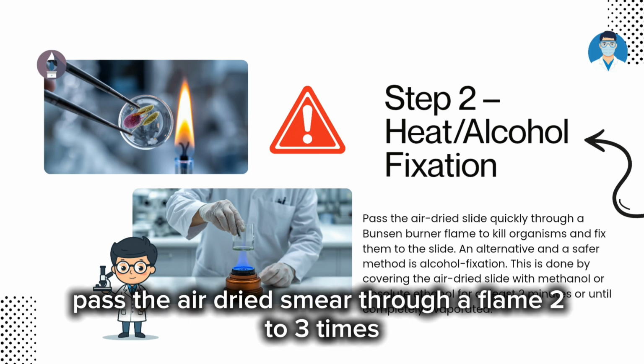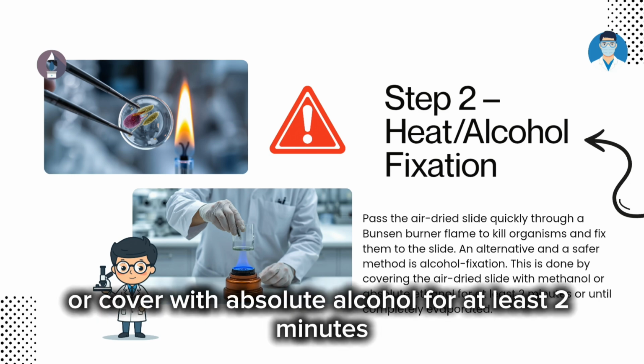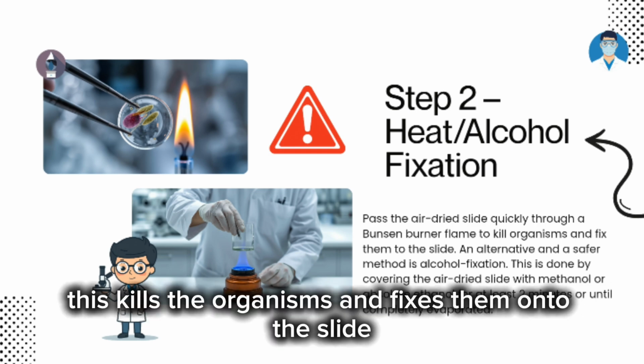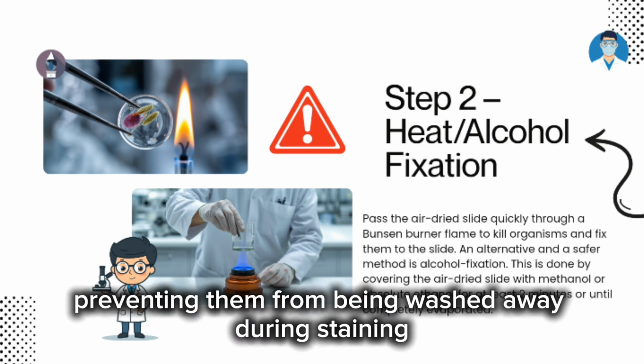Pass the air-dried smear through a flame 2 to 3 times or cover with absolute alcohol for at least 2 minutes or until completely evaporated. This kills the organisms and fixes them onto the slide, preventing them from being washed away during staining.